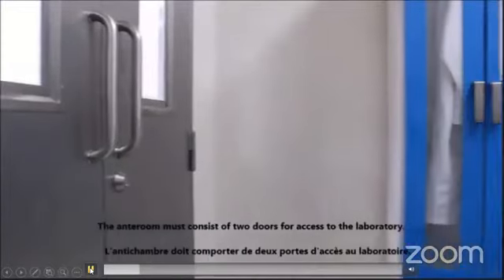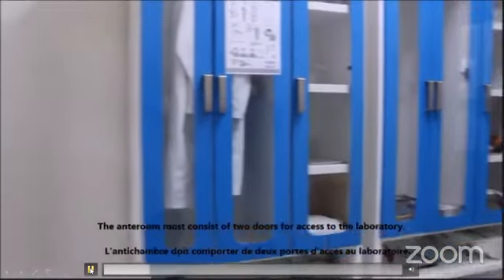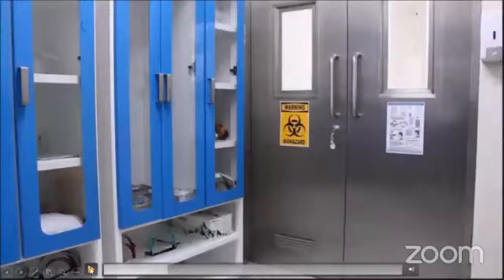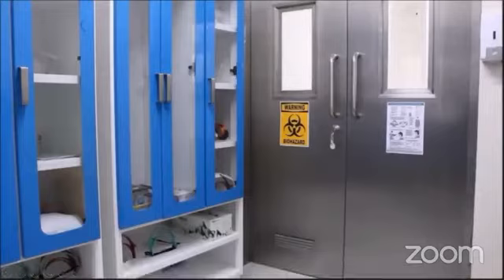Anteroom. The anteroom must consist of 2 doors for access to the laboratory. Anteroom doors should be interlocked or alarmed, so only one door may be open at a time.